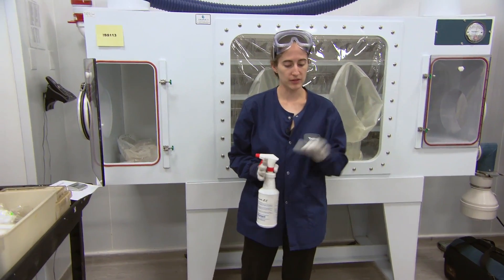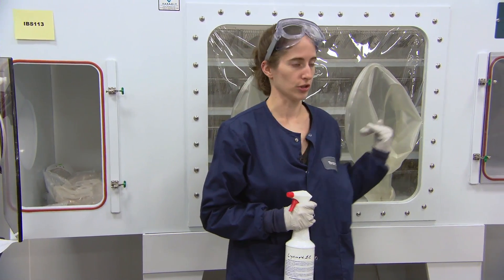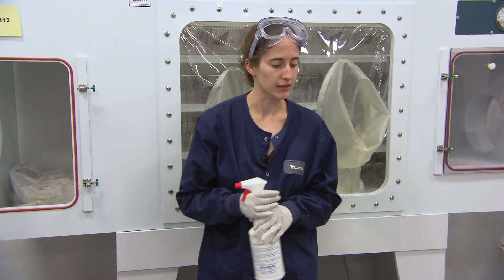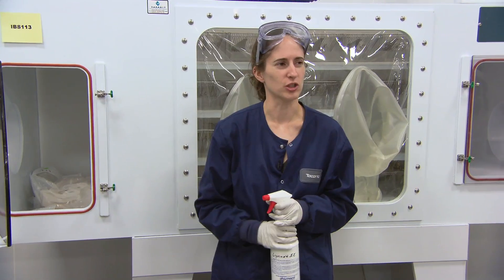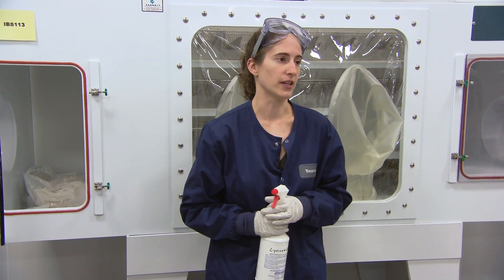For the purposes of these isolators, we do swabbing when the isolator is sterilized to ensure sterility. If you were doing germ-free studies, I'm not sure — I would ask Jamie that question. I would imagine she's putting in quite a few at the beginning and then replenishing as needed.